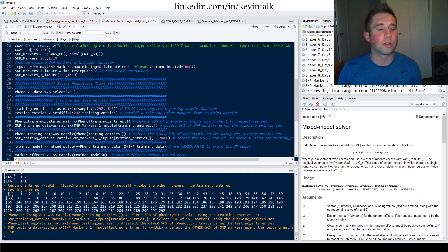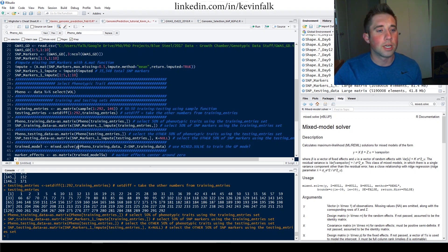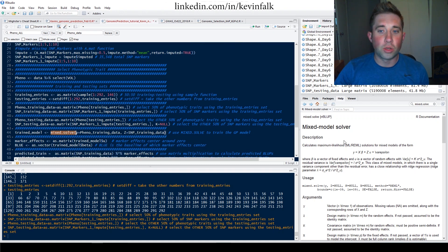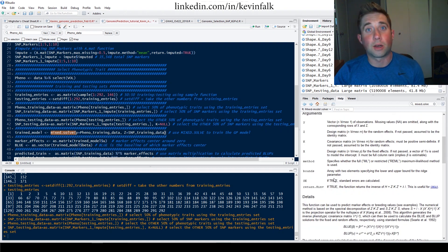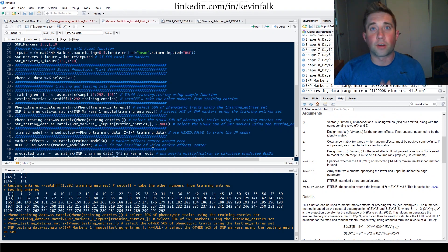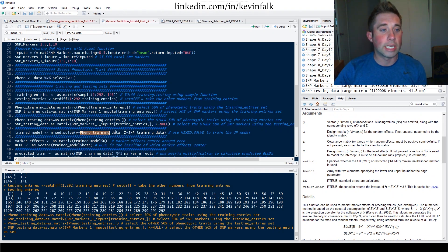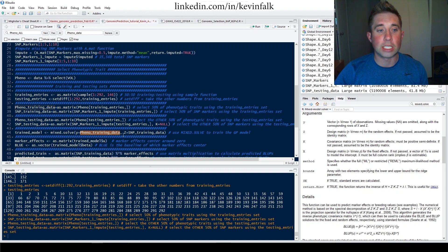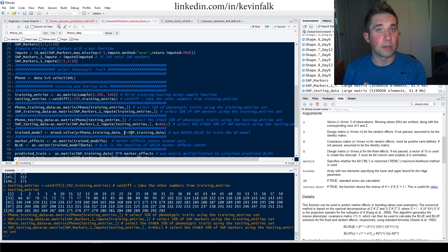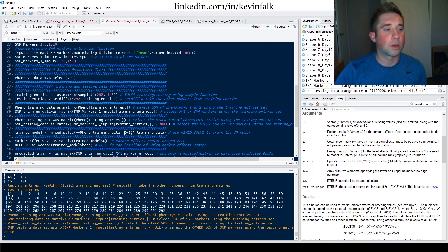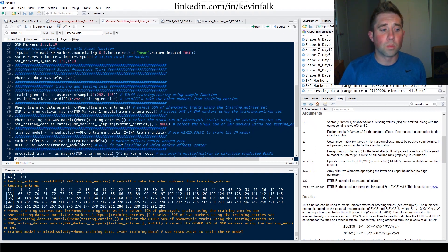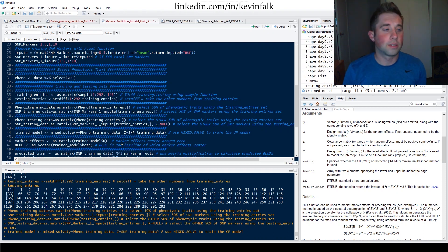The next step is to run the model. I'm going to use the mix.solve function in rrblup — it's quite simple, and we're not going into any advanced functionality. You can use the help function to read up on the description, usage, and arguments, which I highly recommend. For our purposes today, it's pretty straightforward: the phenotypic training data is your Y — the left-hand side — and the right-hand side is the SNP training data. We have phenotypic data on one side and molecular marker data on the other to build the model. Running that, it really doesn't take very long — just a few seconds and it's done.